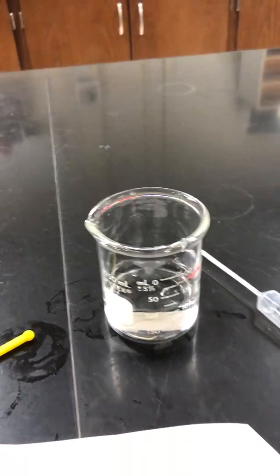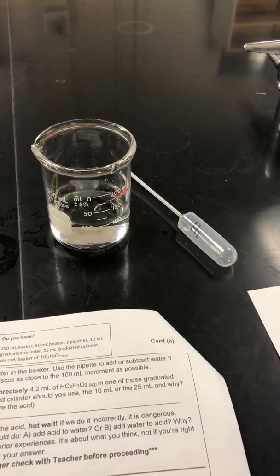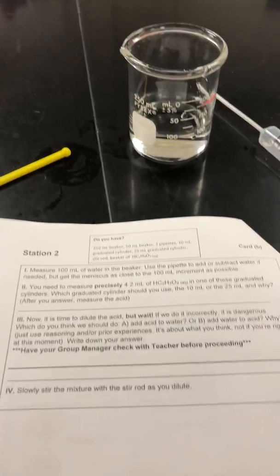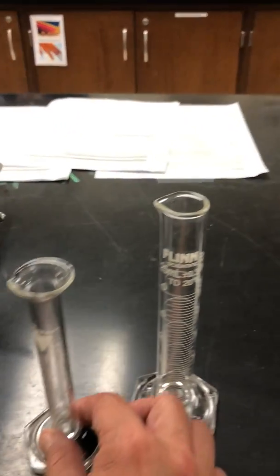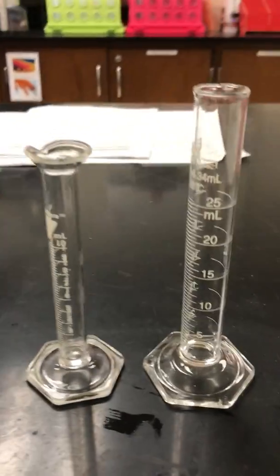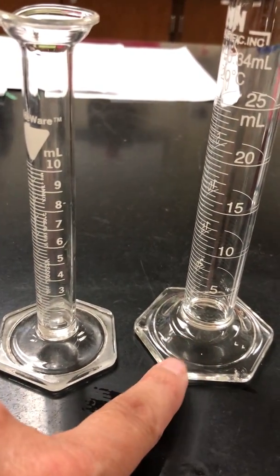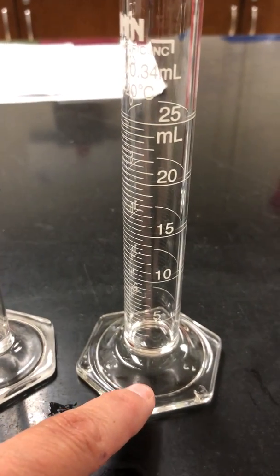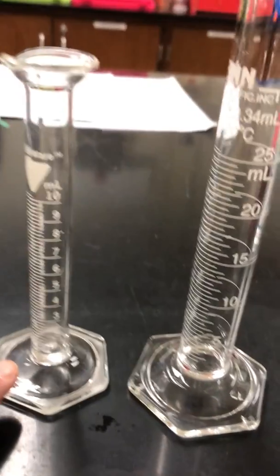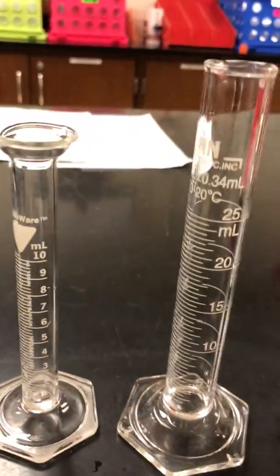All right, then it says measure precisely 4.2 milliliters of HC2H3O2 in one of these graduated cylinders. Which do I think I should use? The 10 mil or the 25 mil? And chemistry students, you're looking at the increments. I need to get 4.2. Each one of these in the 25 mil is worth 0.5 milliliters. So getting a 0.2 is going to be very difficult. Each one of these is worth 0.2. So there you go. I can get exactly 4.2.